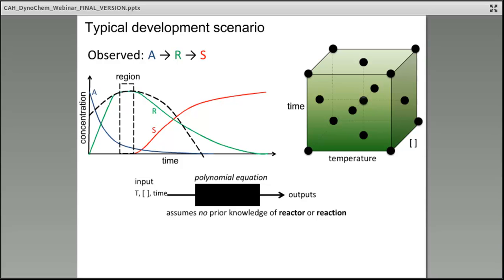Most of us are chemists and chemical engineers. We have a good idea of how we expect this process will be taking place. So what we believe is that we should use this to generate the models to predict reaction output. And then because we're using the intrinsics of the model, that would let us extrapolate better.